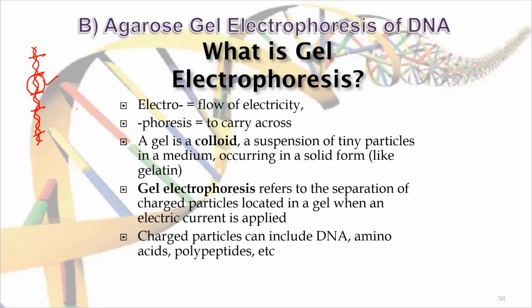If we look at how it is done very practically, you will isolate the DNA, and you will have the DNA in a buffer. In a test tube, you have the buffer, and in the buffer you have the DNA molecule. When you have put the restriction endonuclease enzyme in it, it has broken down into multiple pieces. Now this buffer in this tube contains a lot of DNA fragments.